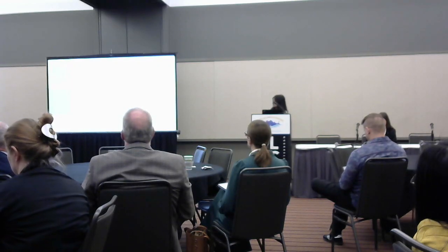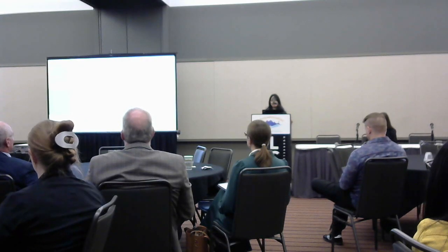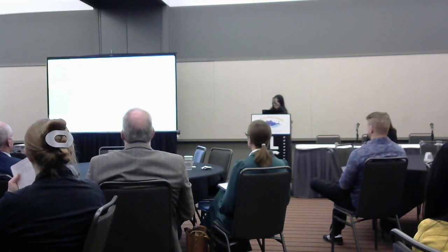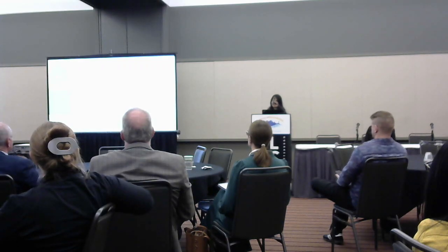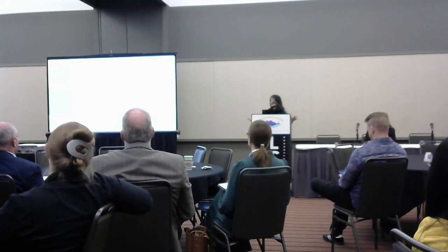Now this comparison is just to show you the raw power of our HPC. The HPC at Seattle Children's has been named Sasquatch because we are a children's hospital, we get to come up with cool names. And here are some specs of the 2 local workstations that we have in the core. Even the Lightsheet workstation, the IT team told me, is one of the most powerful workstations that we have in the Institute. It is a really beefy PC. It has a very good Threadripper 24-core CPU, really good RAM, a very nice graphics card, but when you're dealing with terabyte-sized files, you often come to a limitation there as well.